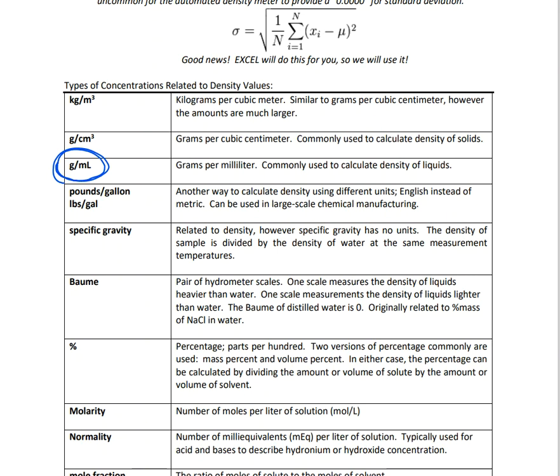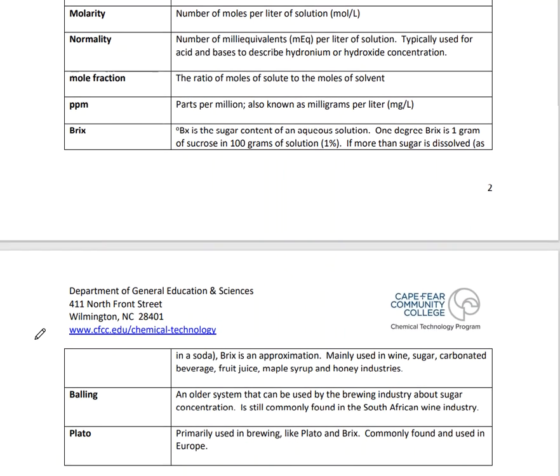And this is the unit that will come along with density every time that we report one in a proper scientific laboratory. But again, depending on the field and depending on the laboratory in that field, you might be required to report these values or concentrations or densities in a number of different ways. So just kind of an FYI thing, that stuff might be coming.